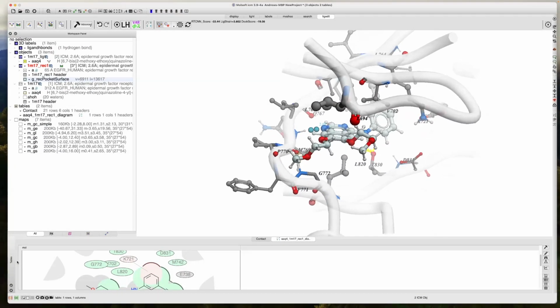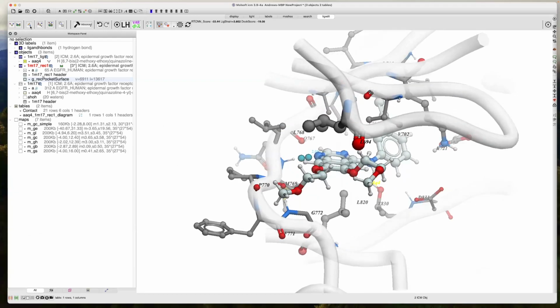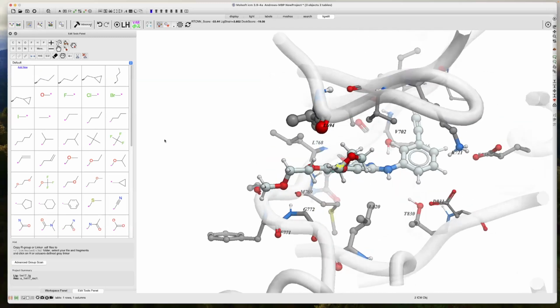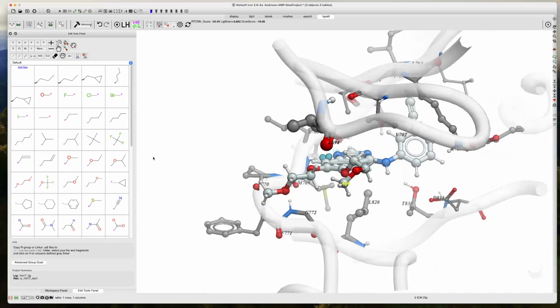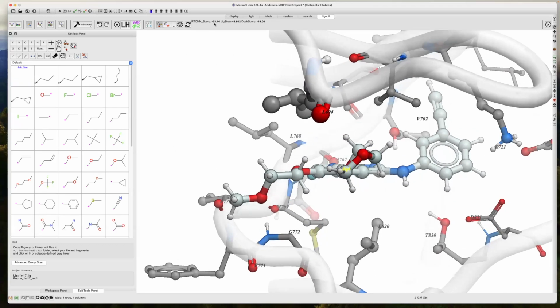Okay, so we now are ready to make modifications. To make modifications, we need to open the modification panel, which is this button with the pencil. So you single click, and it opens this panel. Just to be sure, we can see at the top here, we have the score, RTCNN score, which we'll discuss in 2 weeks' time, which is our neural network score.